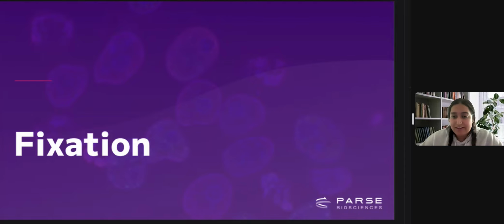And okay, so for fixation, now we're actually going to talk about the Parse part of it, so we haven't opened anything in the kit yet. So once we're ready to open the kit, this is the protocol for fixation. Like I said, it's going to be very straightforward.